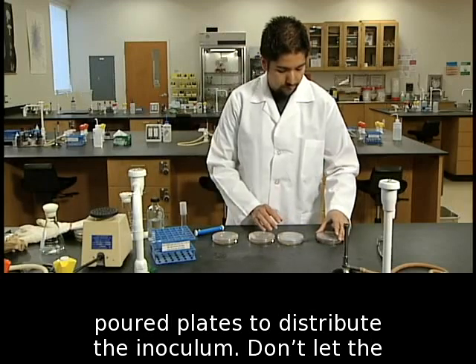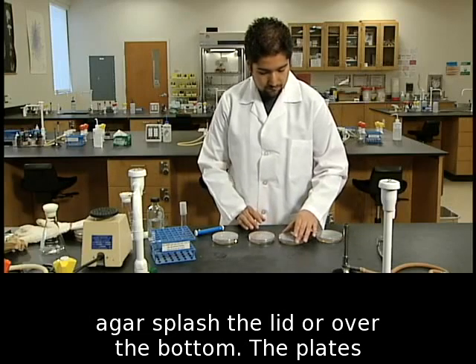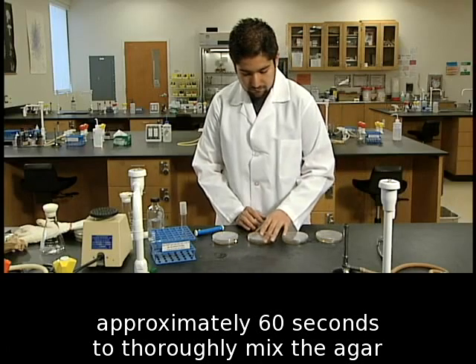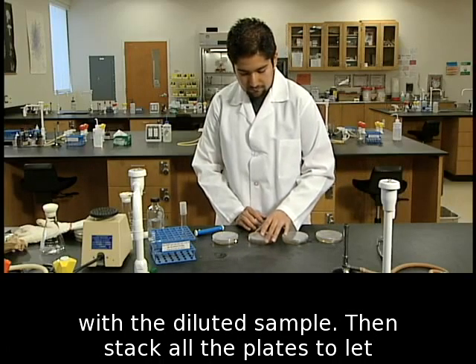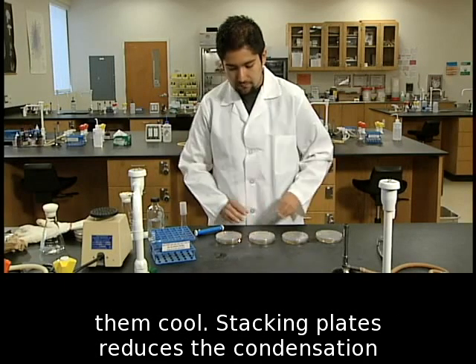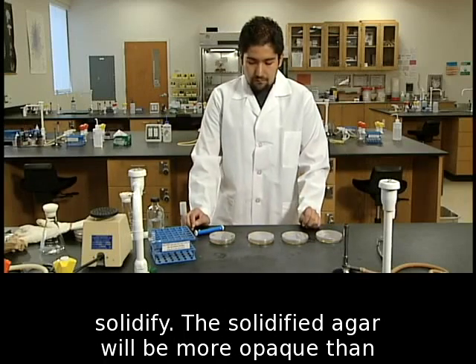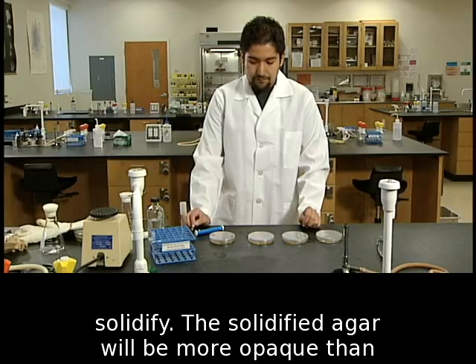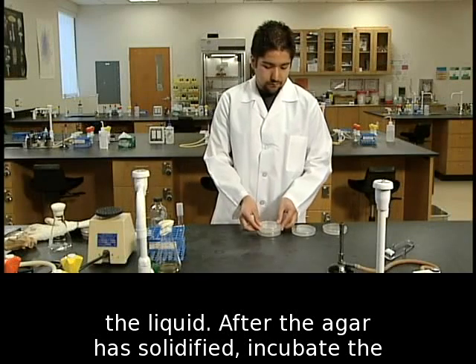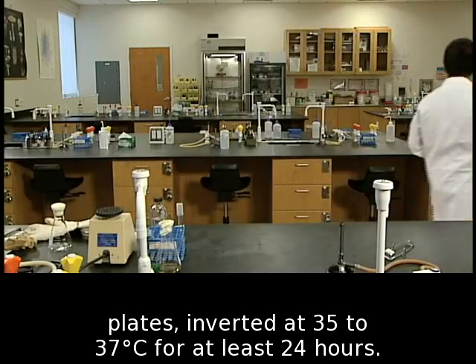Gently swirl the poured plates to distribute the inoculum. Don't let the agar splash the lid or over the bottom. The plates should be swirled in a figure-8 pattern for approximately 60 seconds to thoroughly mix the agar with the diluted sample. Then stack all the plates to let them cool. Stacking plates reduces the condensation formed on the underside of each lid. Let the agar solidify. The solidified agar will be more opaque than the liquid. After the agar has solidified, incubate the plates, inverted, at 35 to 37 degrees Celsius for at least 24 hours.